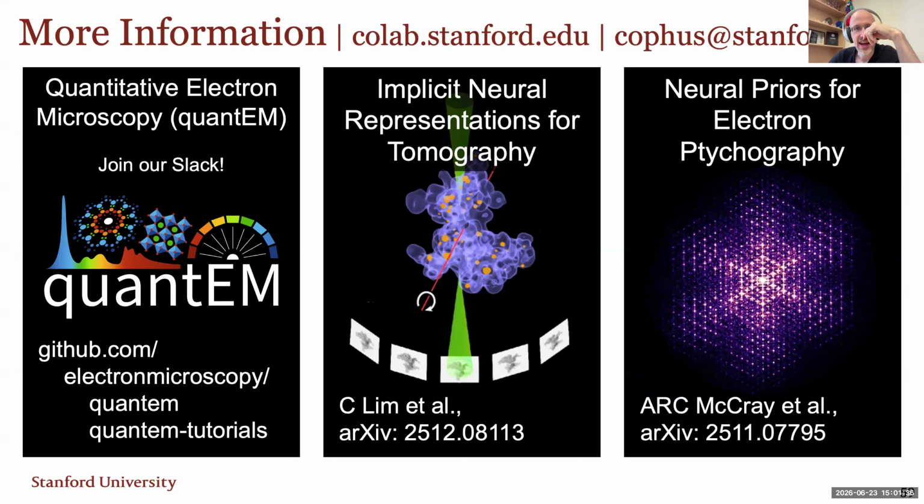And then returning to 3D electron diffraction, Arizo again asks about solving the problem for 3D electron diffraction patterns from Moss here, indexing the images. You're asking if a graph representation for the data set is suitable. Yes, if you're working in Bloch wave space to solve the intensities that way. But if you're working from the 3D voxel cloud, no, right? I would use the INR to represent the intensity, to inpaint both the intensity and to inpaint the phase. But in order to inpaint the phase, you have to couple it with a phasing algorithm, right?